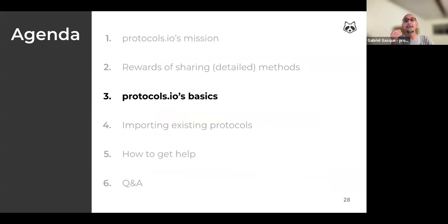Now, let me give you a taste of how the platform looks and how its different tools allow you to do everything I listed before. Organize and preserve your work, collaborate, save time, increase your reproducibility, impact, and credit.